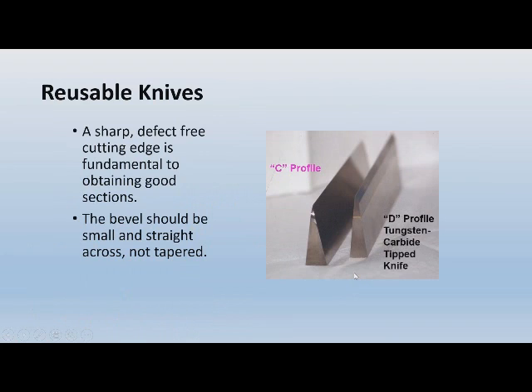Blades. Back in the day when I was in histotechnology school, I had to use this C-profile blade. All of you out there who had to do it too, just kind of shake your head up and down, and I'll feel the vibrations down here in Florida. So every day we had to hone and strop these things. We used a Belgian waterstone to hone them, and then we had a strap that you would find in a barber's office. So constantly the bevel of the blade was changing.